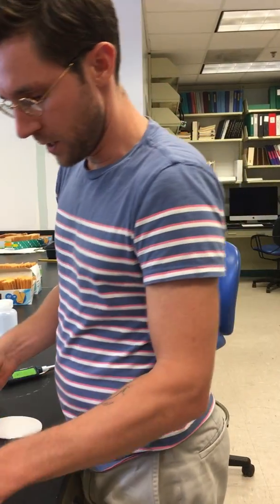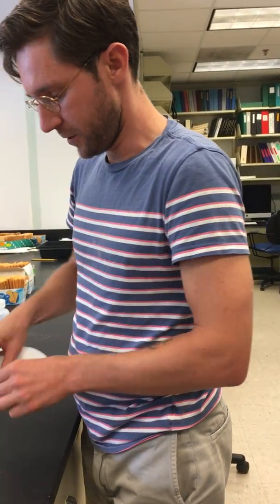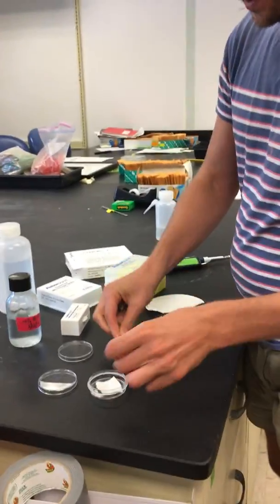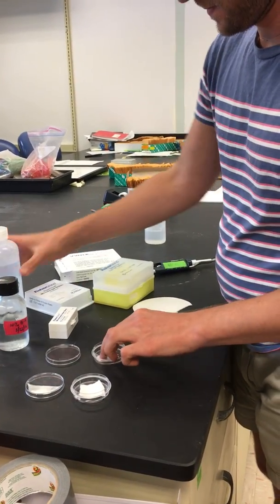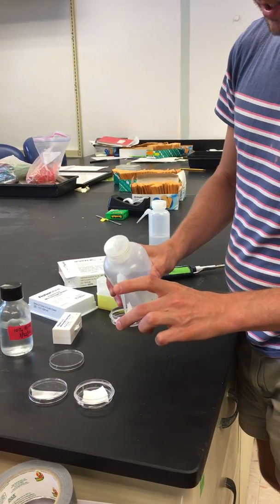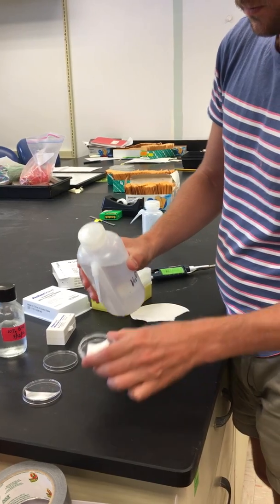So what I do is take pieces of filter paper and place them in the bottom of the petri dish and get them fully saturated.